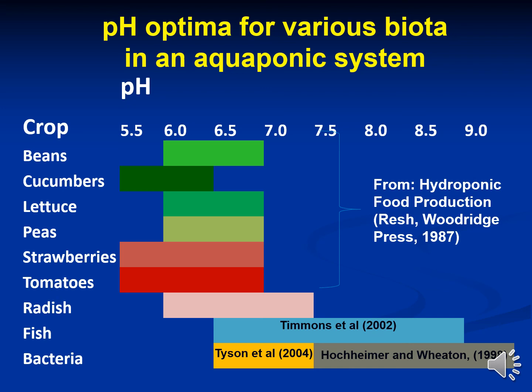pH is measured with many easy methods, from chemical test kits to low-cost battery-operated meters. I do suggest, if you use an aquarium kit, to also purchase a hydroponic pH kit. Most aquarium kits only measure down to a pH of 6. You could have a much lower pH than 6 and not know it until it was too late. Hydroponic kits have much lower pH ranges.